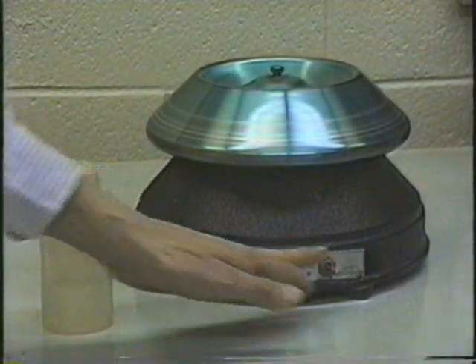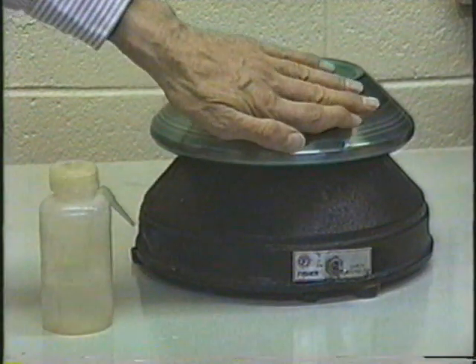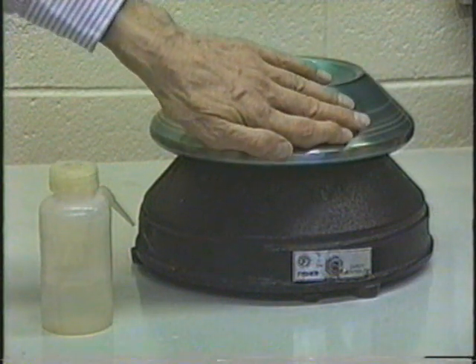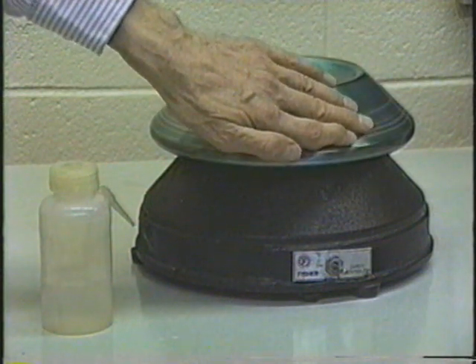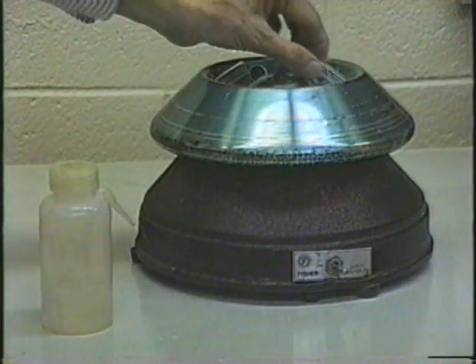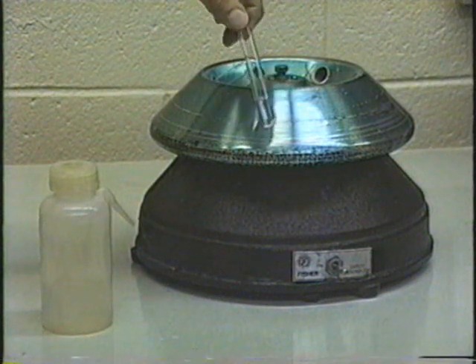In about 30 seconds, you can turn off the centrifuge. Separation should be completed. Stop it, put your fingers so that they are in the same direction as the spin, and then lightly touch the side here. There's your separation. As you can see, it is completely separated.